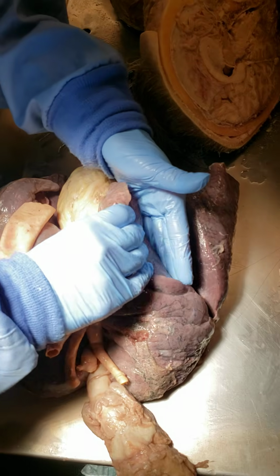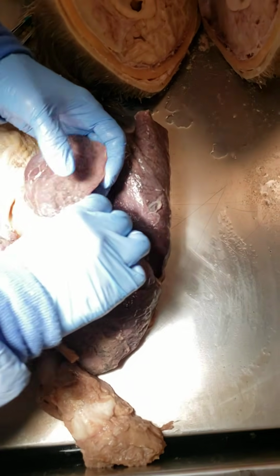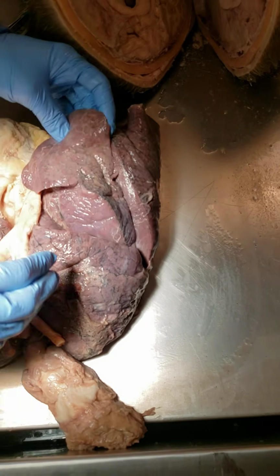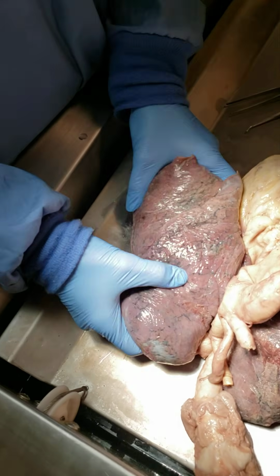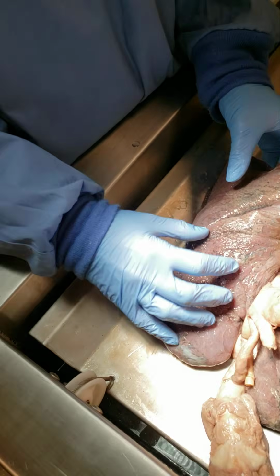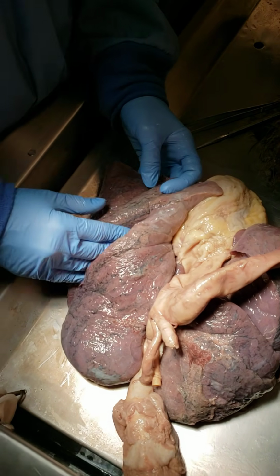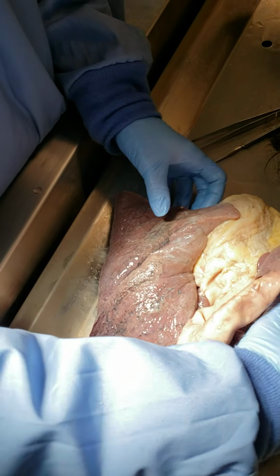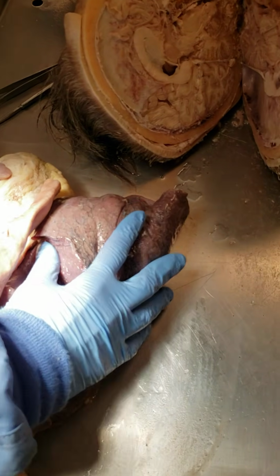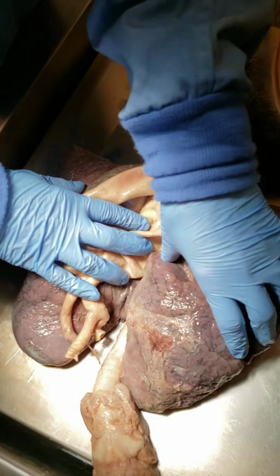And then the space separating the middle and inferior lobe would be the oblique fissure, okay? And my left lung has 2 lobes, a superior and an inferior lobe, and there's an oblique fissure. So again, the right lung has 3 lobes, the left lung has 2 lobes.